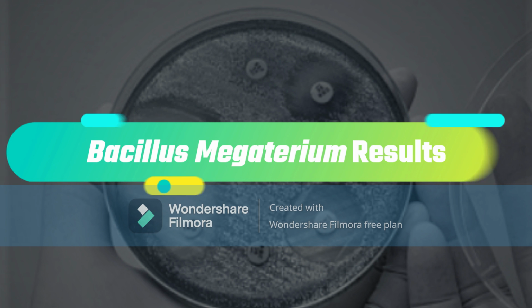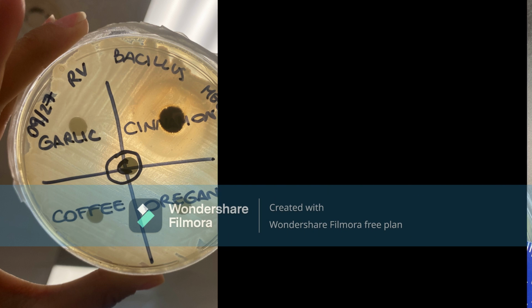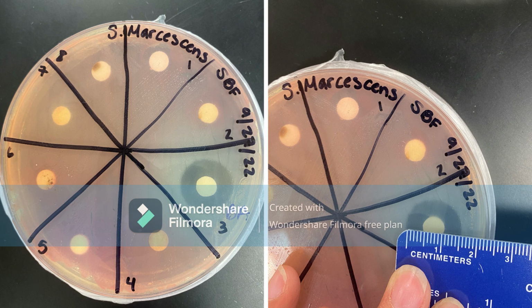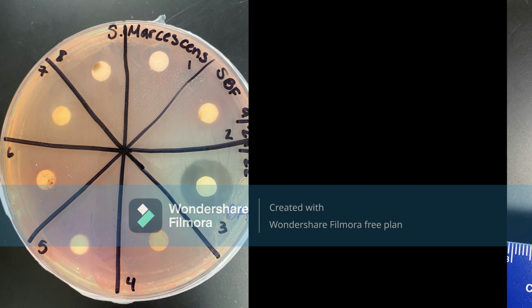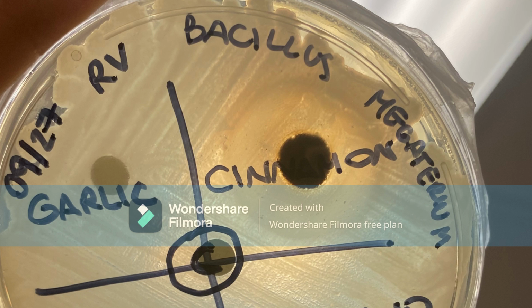In this next plate, we have a culture of Bacillus megaterium. Interesting enough, instead of a zone of inhibition, we have some swarming behavior around the disc with cinnamon. This area measures around 25mm. In this next plate, we have a culture of Serratia marcescens, with the third quadrant testing for boric acid inhibition. There is a 15mm zone of inhibition, so that means that Serratia marcescens is sensitive to boric acid, as expected. An unexpected result was definitely the swarming behavior of the Bacillus megaterium that was exposed to the cinnamon. Swarming behaviors usually occur when the bacteria is supplied with a nutrient they really like.